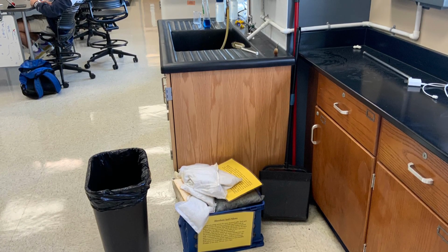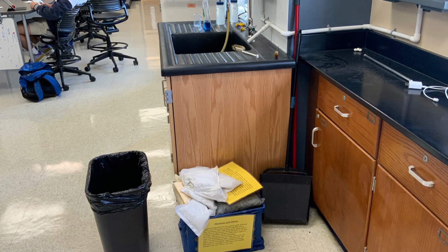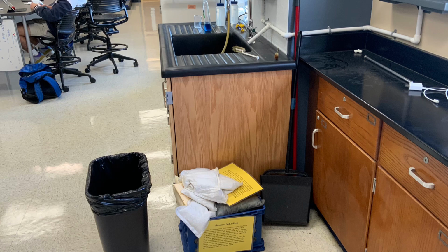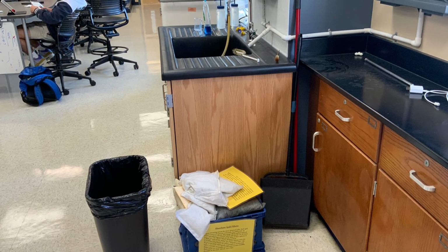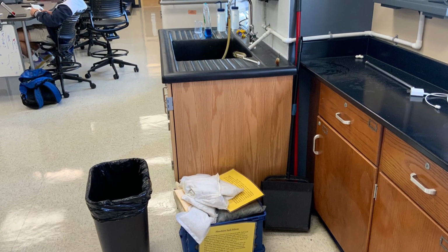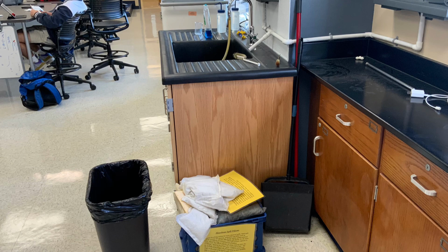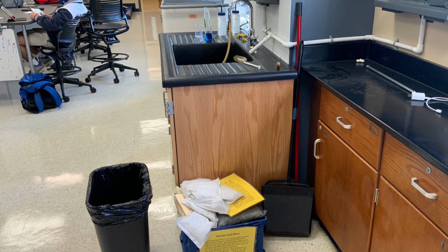The section that I got wrong was section 1 about the different parts of the lab. So I thought that I would make a video going over all of the different parts of the lab and the different purposes that they serve, and what you should do with the different items in the lab regarding safety when different scenarios come up.